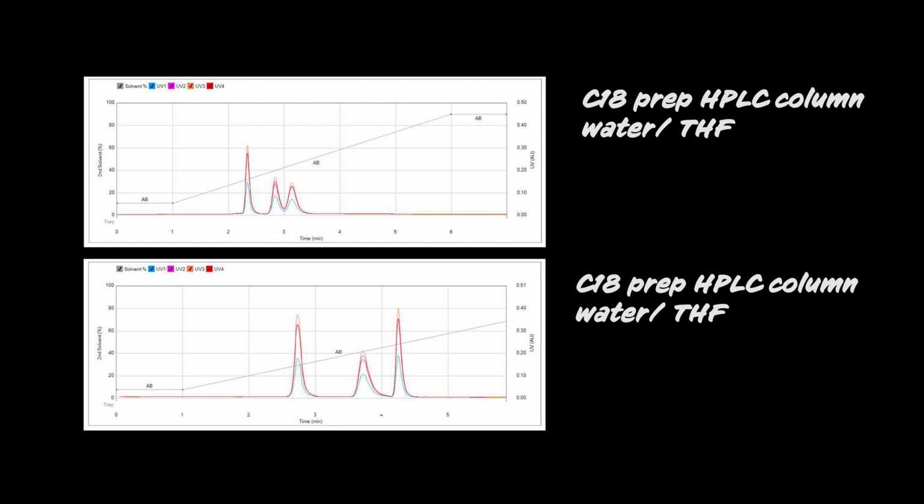With THF, it is impossible to separate the 3 compounds under the same run conditions due to its strong solvent strength. We must change the run conditions to achieve separation.